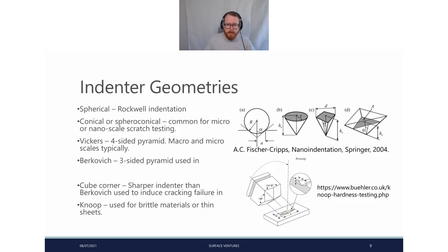But also, if you're going to look at various roughness parameters and you want to get a better idea of that, extending from 2D to 3D would be very good. That would be useful, because then you can have a 3D map that you can compare, if you have access to the instrumentation for this.